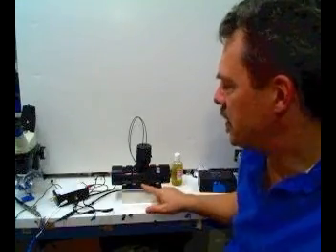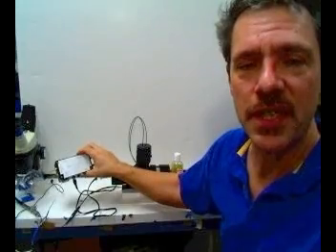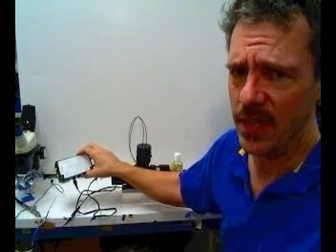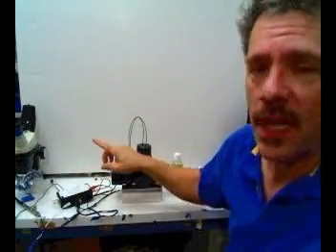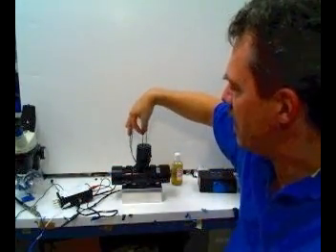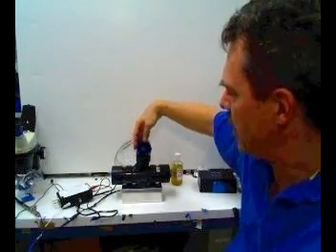The imager sensor sends its signal to this synchronization box, which determines if it's an even or an odd field. If it's an even field, it turns on a blue LED, which shines its light through this fiber optic to the left side.